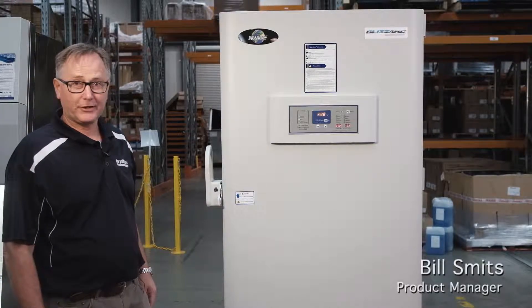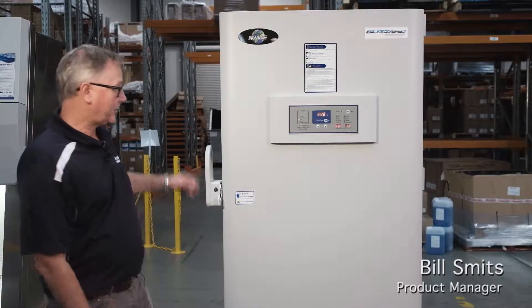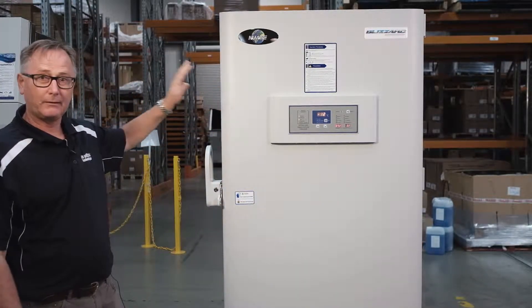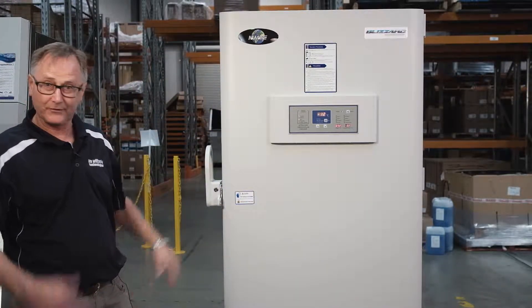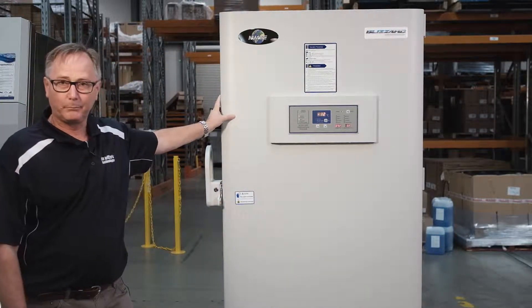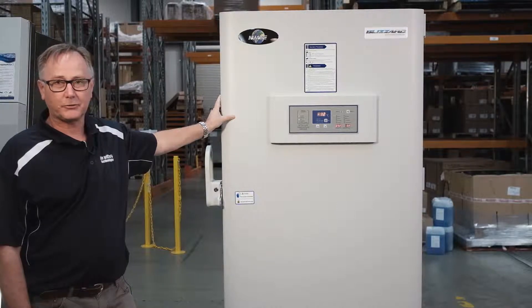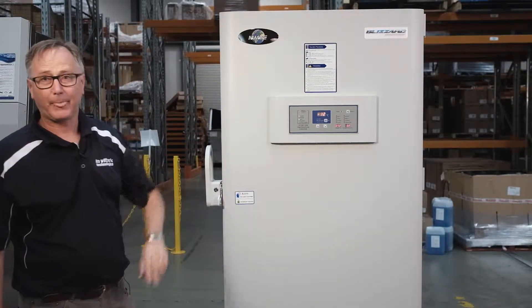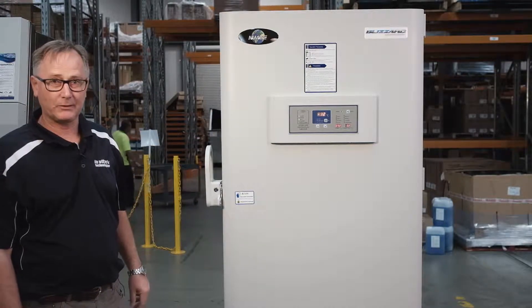Hi, I'm Bill Smits from In Vitro Technology. I'm the product manager for cold storage, and this is one of my products that I will be featuring in this video. This is the new range of minus 86 ultra cold freezers. It's called the Blizzard. It's from Newair, so we know that the brand is reputable.